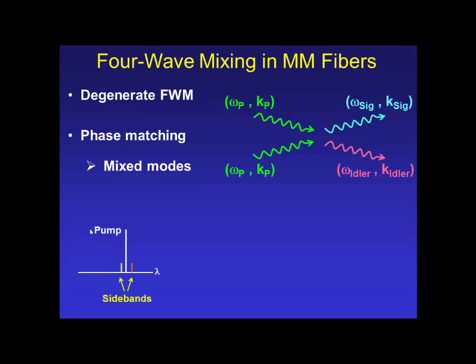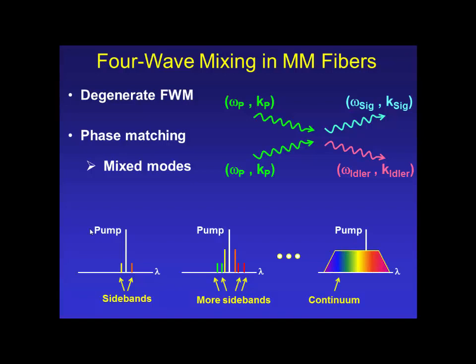We're basically leveraging that, and so then you can develop your sidebands, and they can grow in intensity and create more sidebands. Eventually, you can get a continuum.